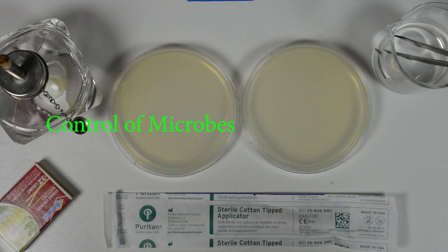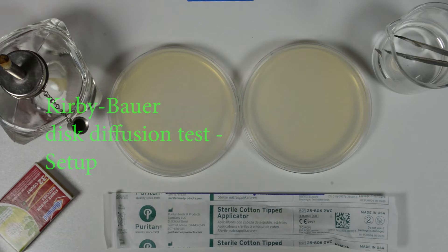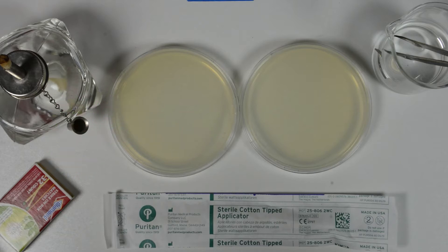This video is part of the Control of Microbes lab. This video will particularly deal with the setup of Kirby-Bauer tests to assess the sensitivity of a bacterium to antimicrobial agents.